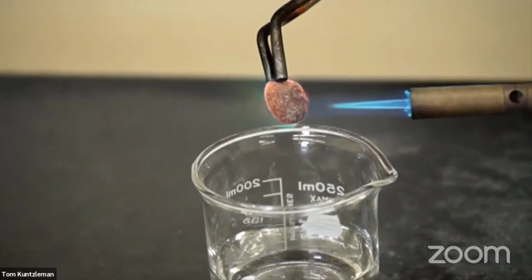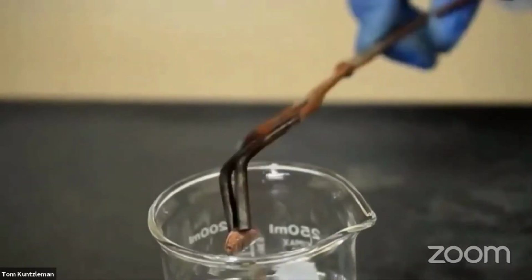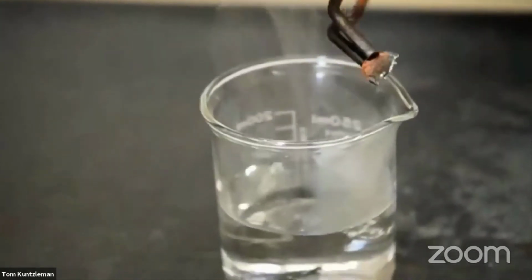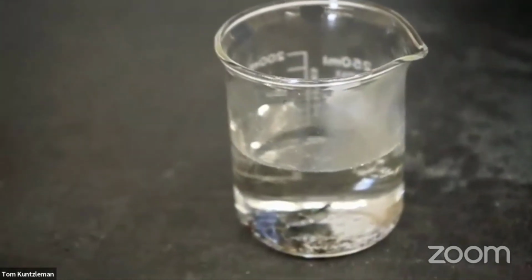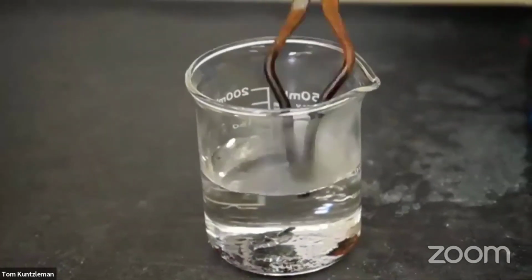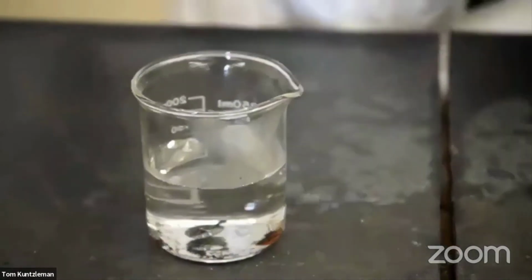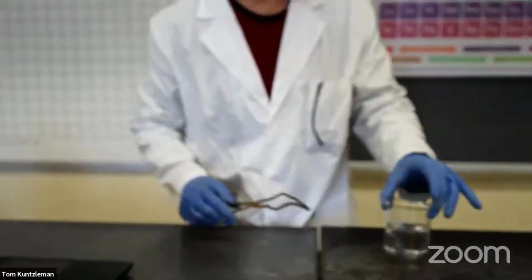Oh, I hope you can see that on the video. It is just all over the place. Yeah, look at that, it's going to melt. I don't know. I think the jury's out, but I think it's got potential. Great question, great idea. I'll be doing that experiment quite a few times to see what's really going on.